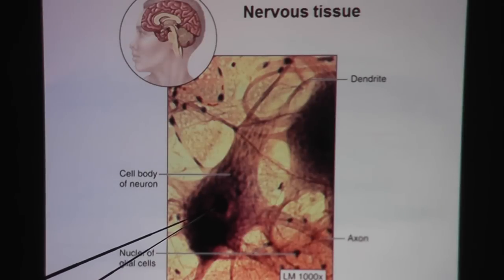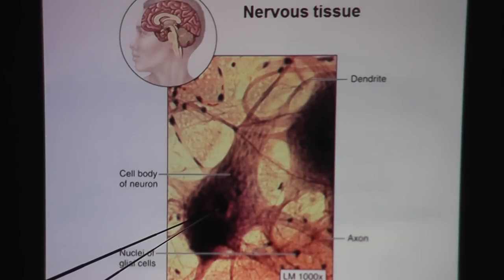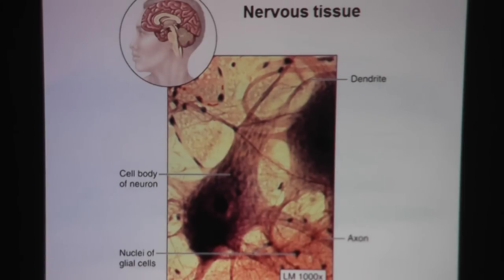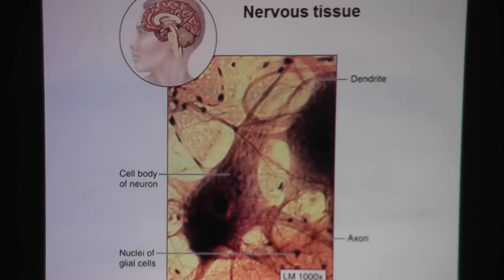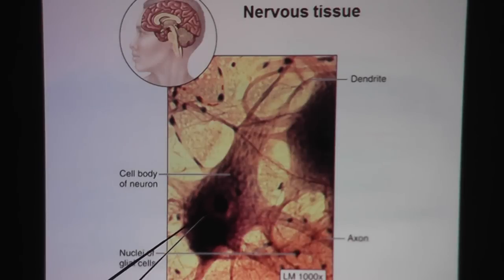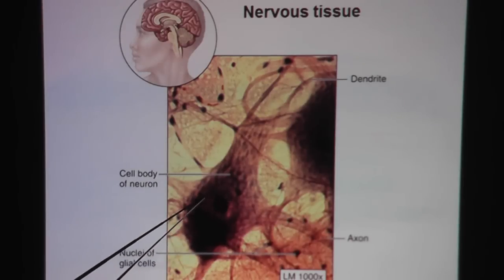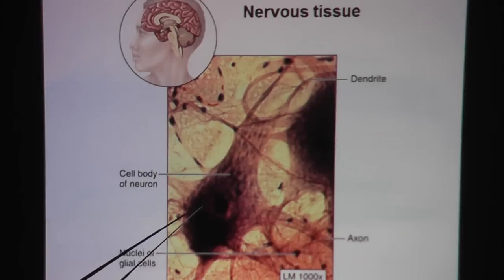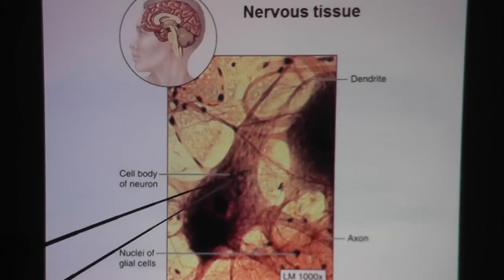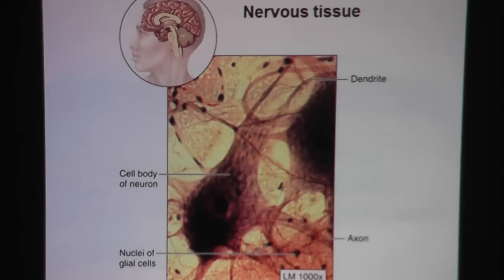This dark dot — some of you may be tempted to call that the nucleus, but it's not. That dark dot is the nucleolus. Please be careful with the spelling because spelling does count on the practicum. The nucleolus is found inside the nucleus. If you look around the dark dot, there is a circle, a little bit of a clearing around it. That whole region where there's the clearing would be the nucleus of the neuron.